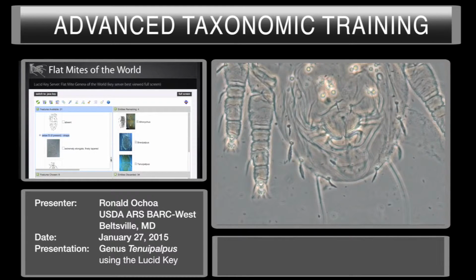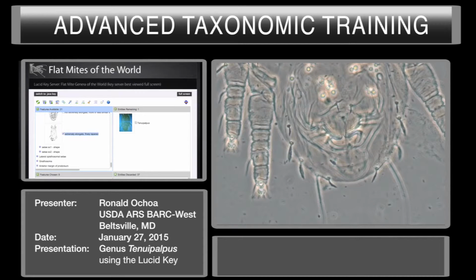If F3 is present, what kind of shape is that seta? We saw that it is normal. It's not elongated, it's a normal shape. That means that you select the normal shape. Okay. Now you go to H2, and you remember what we saw with the H2. The H2 is extremely elongated. SC1 is present and is normal.